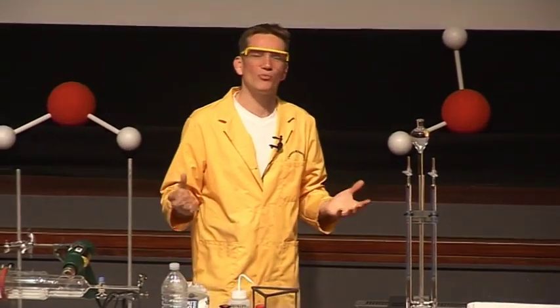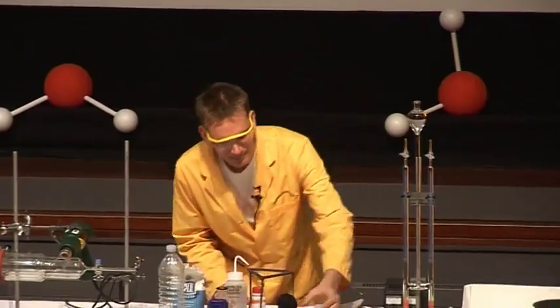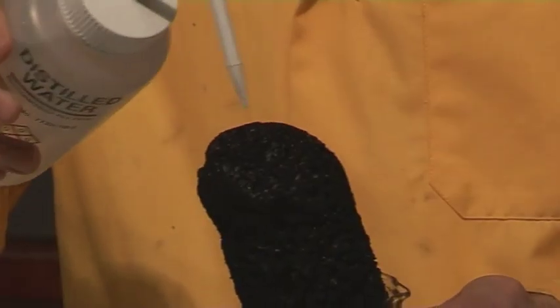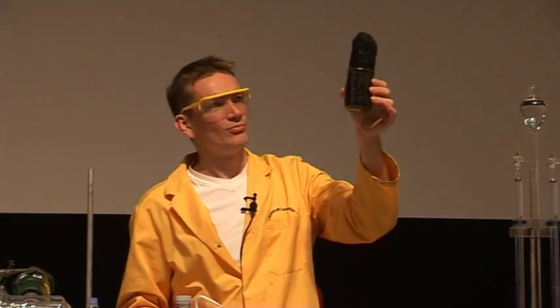So there we are. Well, would that happen? Well, of course it wouldn't. Okay. Let's try this with the sugar. So this is our dehydrated sugar. Adding some water to this, well, we certainly don't get our sugar back. Okay. This is an example of an irreversible change.